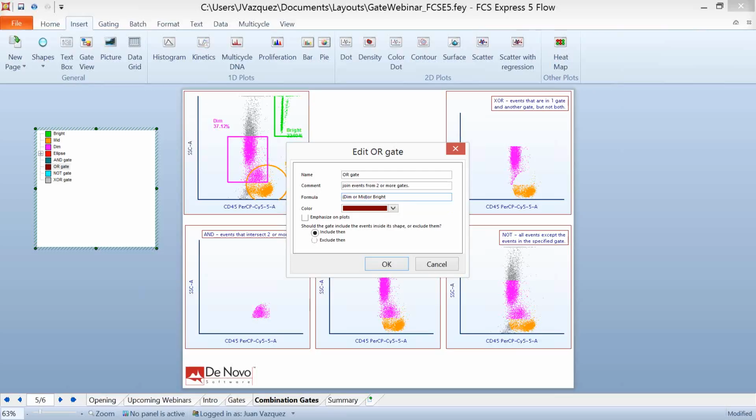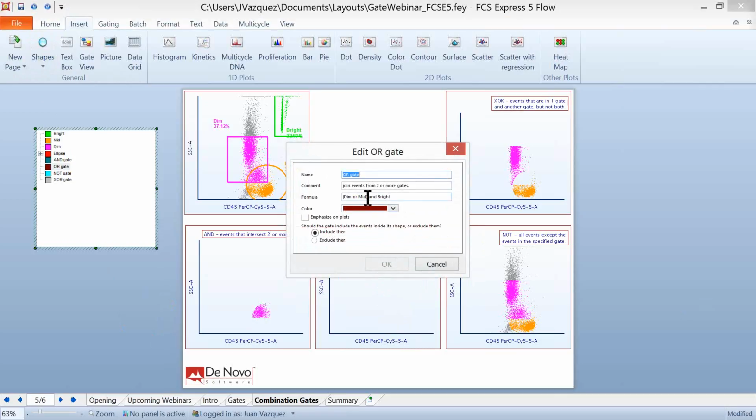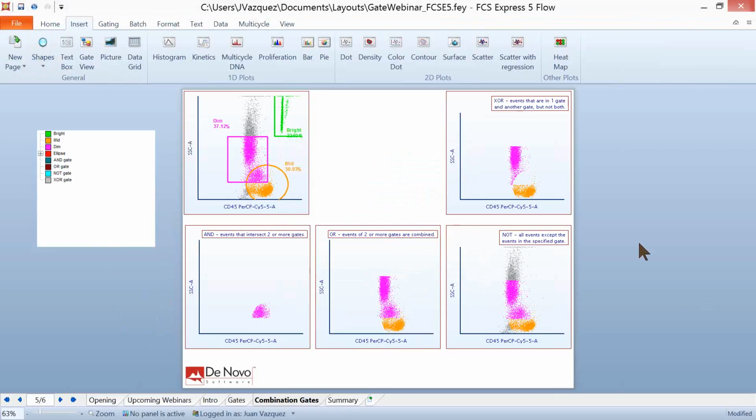We'll close the parentheses. And whatever other population we have, whatever the events are that make up that logic, you'll be able to view that within there. So we can make that as complex as we need to. Let me just edit this. Okay.